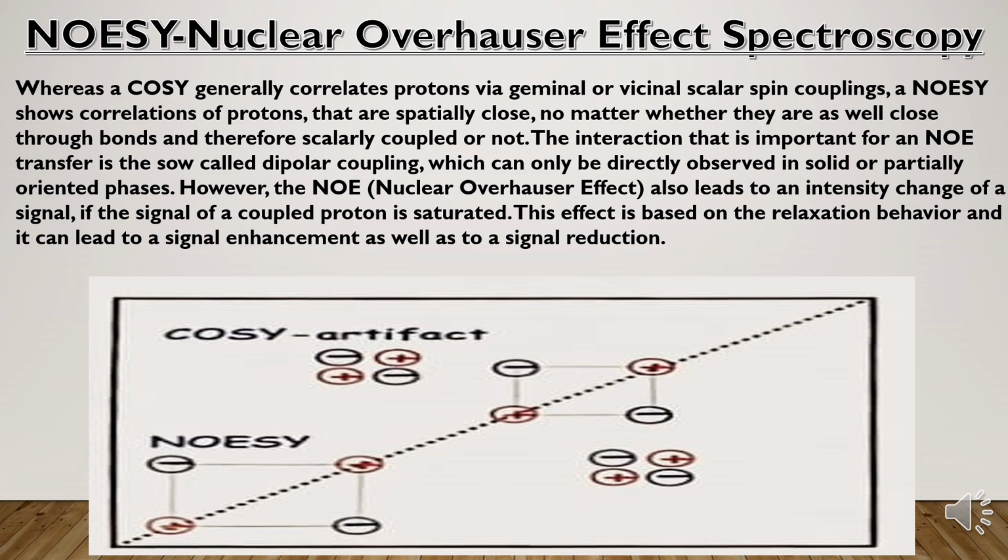However, the NOE also leads to intensity changes of the signal. The signal of a coupled proton is saturated. This effect is based on the relaxation behavior and it can lead to a signal enhancement as well as to a signal reduction.